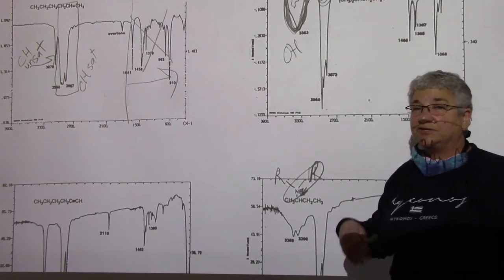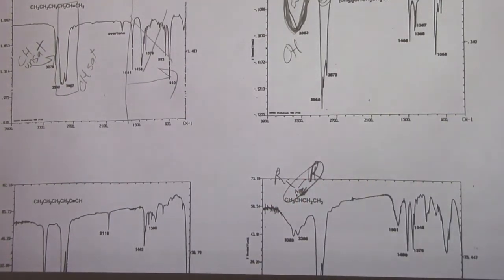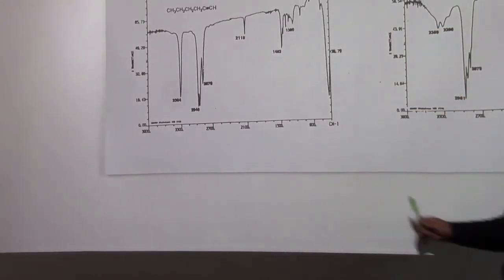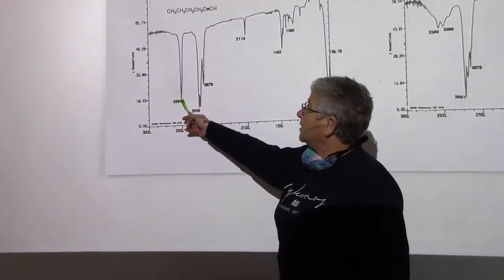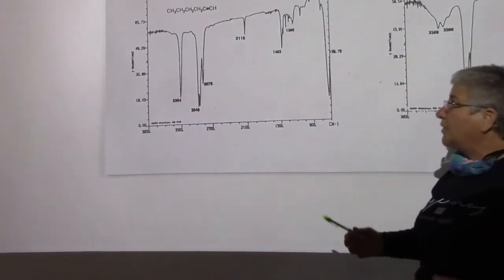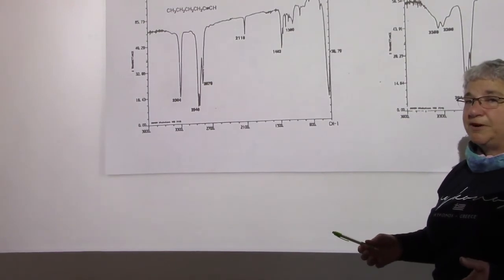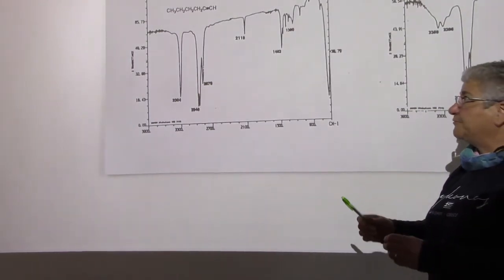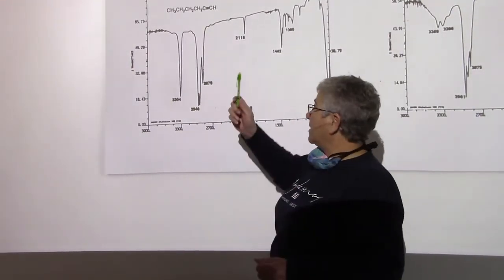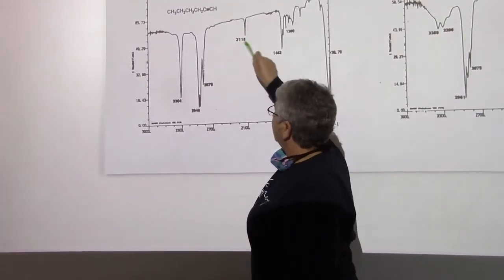and our OH stretches, and the one other thing that shows up in this area is right here. Okay? And so if you look at this molecule, it does not have a heteroatom. There's no OH, there's no NH. It actually has a carbon-carbon triple bond. And here's where you have to be careful. The frequencies that absorb for the carbon-carbon triple bond are right in here.